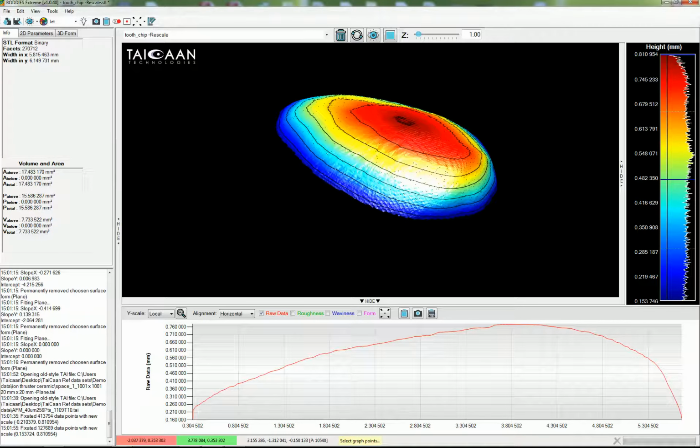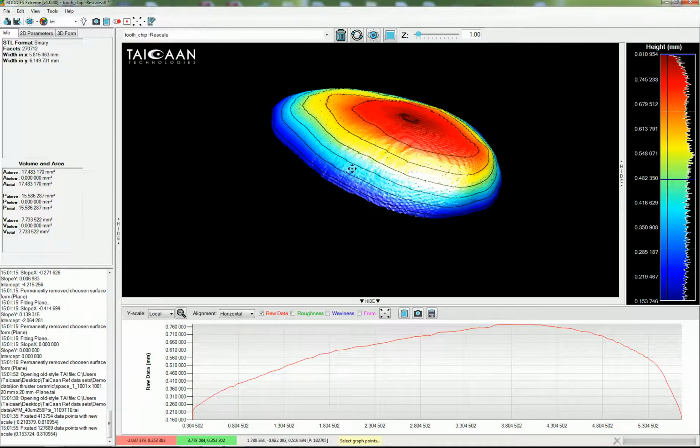And you can see now I'm just concentrating on the upper part of the surface, and I've got a very nice representation of that surface. So I'm now able to do statistical analysis, I'm able to get parameters from the surface, and this is really something quite exciting, and actually as far as we know, this is unique to the BEX software.